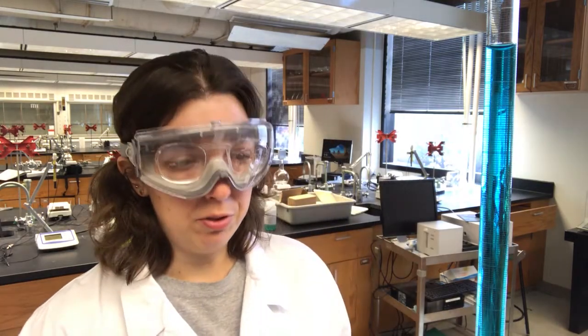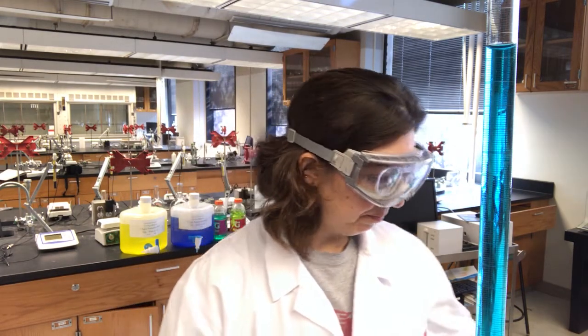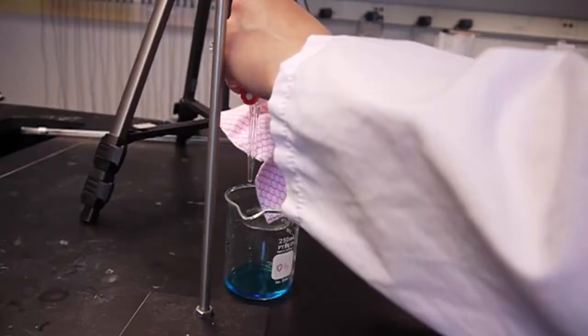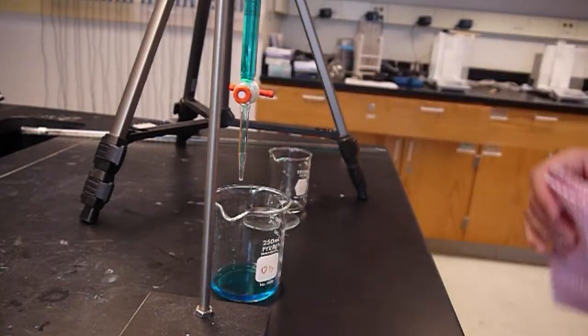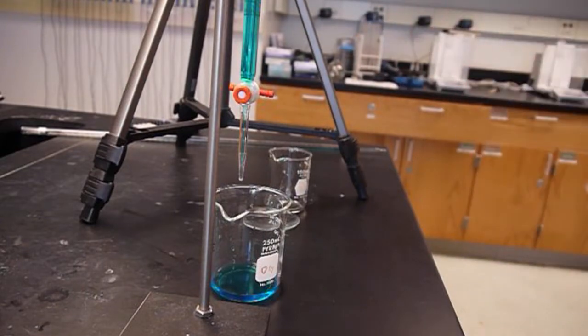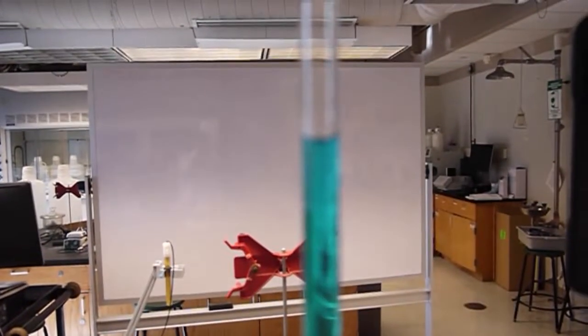So I filled up my burette with my blue solution. I'm gonna wait a minute. There's some bubbles that come up. You'll see those as you're filling your burette. There's a little drip on the outside of my burette tip here, so I'm gonna clean those off. I'm also going to open that burette one more time to make sure that I've filled up the tip of the burette, because this burette is calibrated to include that volume. So once I have a full burette with a tip that is full, I'm going to take a reading at the meniscus of the burette itself.